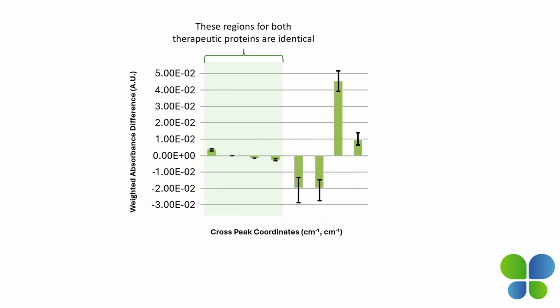Regions of the protein samples that are the same would have a near-zero difference and can also be observed, as highlighted. Ideal for developability and formulation optimization. The bar graphs summarize the quantitative nature of the analysis. The enhanced spectral resolution provided by the asynchronous plot allows for an in-depth evaluation.